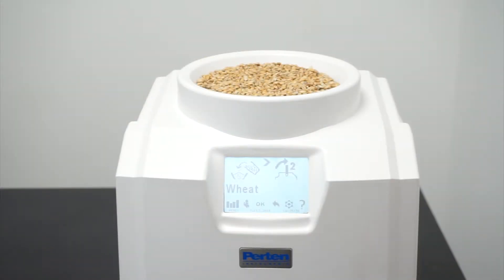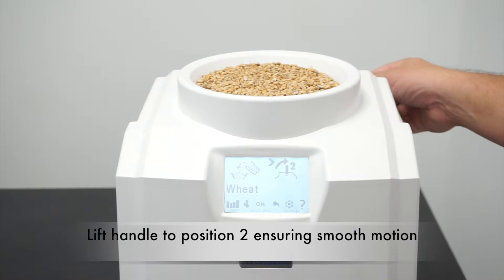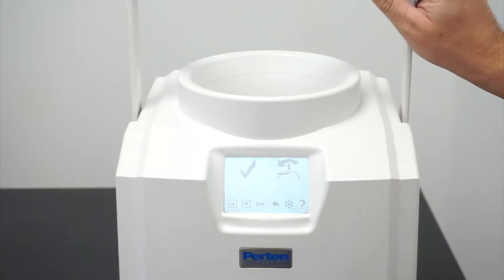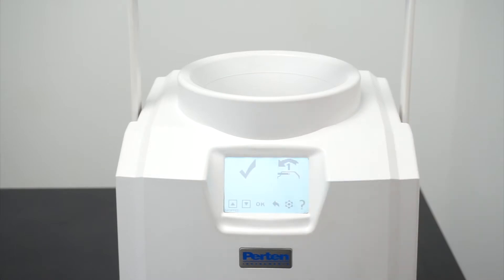Follow the instructions on the screen and lift the handle to position two, ensuring a smooth motion. A tick indicates the handle is being moved at the correct speed. If the handle is moved too quickly, a hare will be displayed, and if the handle is moved too slowly, a tortoise will be displayed.